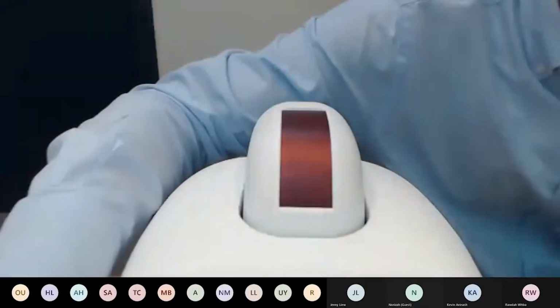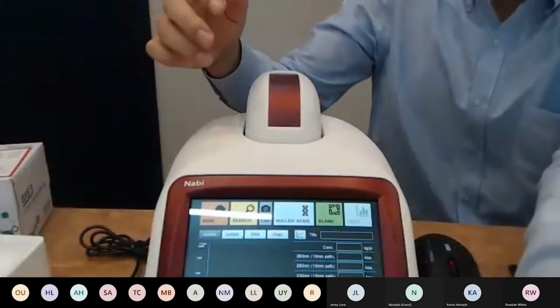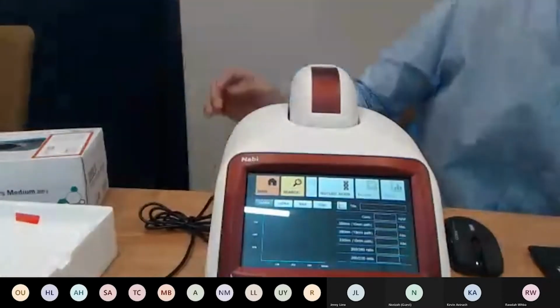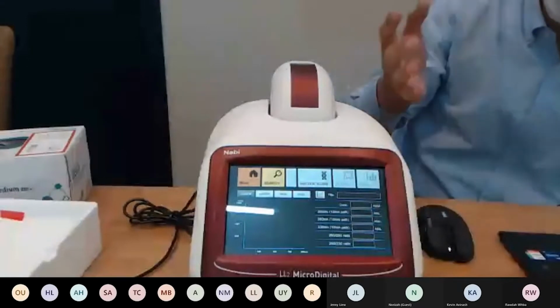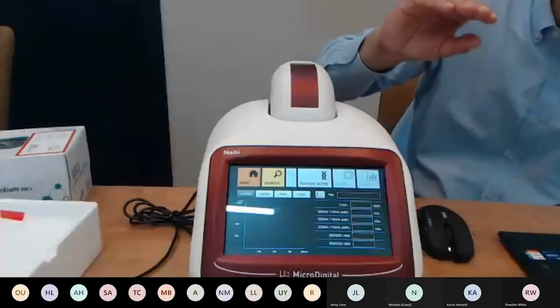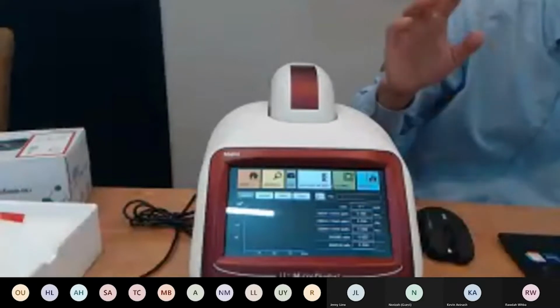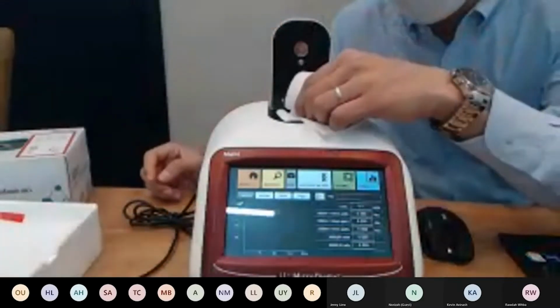Next, all you have to do is close the pedestal and click blank. Yes. Then you'll hear the sound of the motor moving. So it's basically adjusting the length of the column so that you can measure, and that's that, and it's already done. So next, you wipe it.